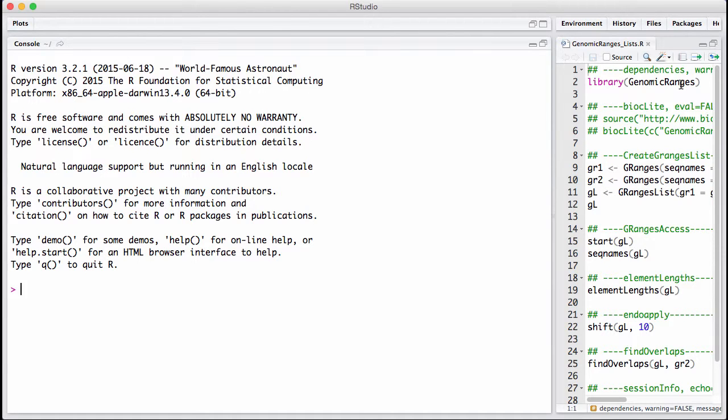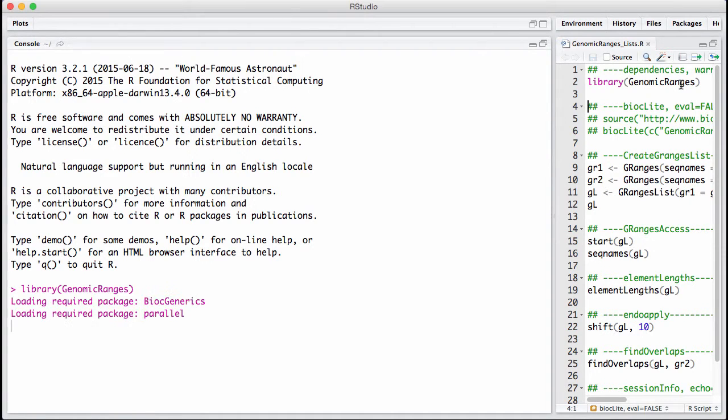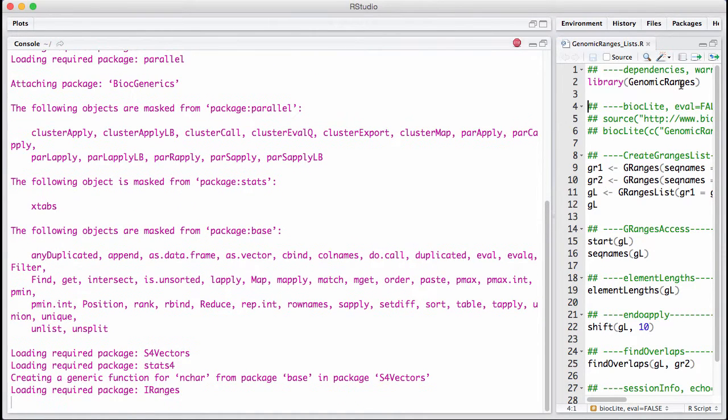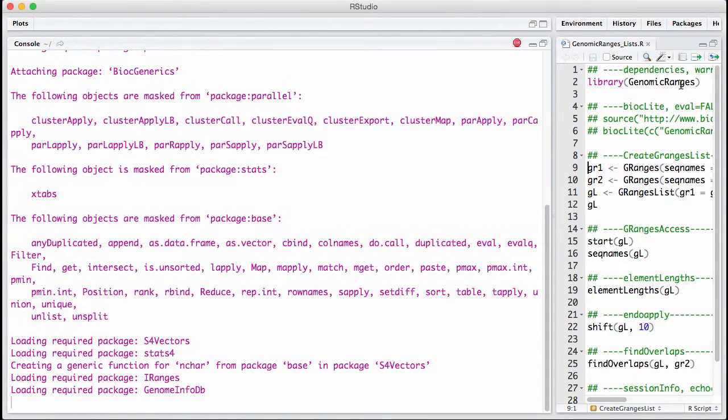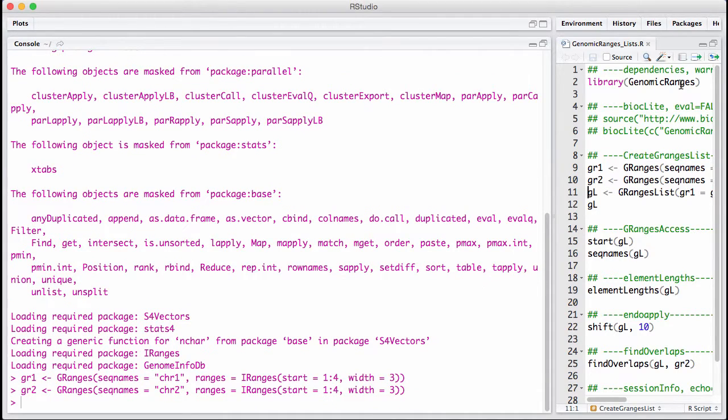Let's load the packages and construct an example. So the first thing I'm doing here is I'm basically constructing two gRangers, one on chromosome one, one on chromosome two.